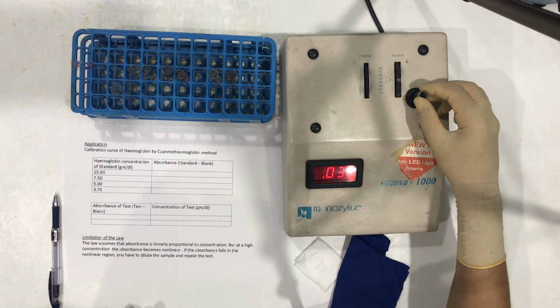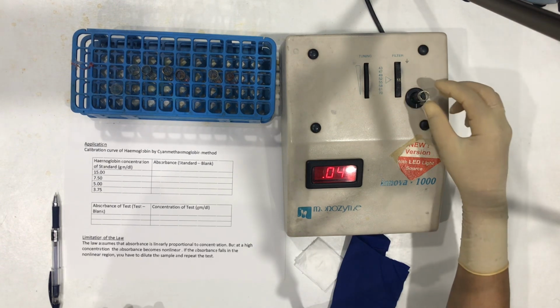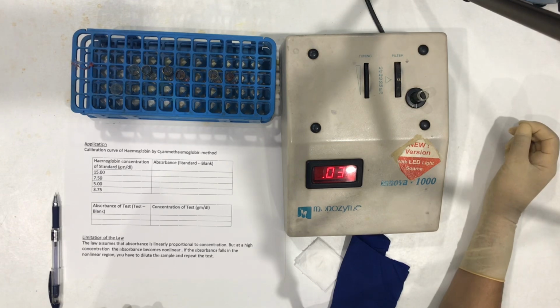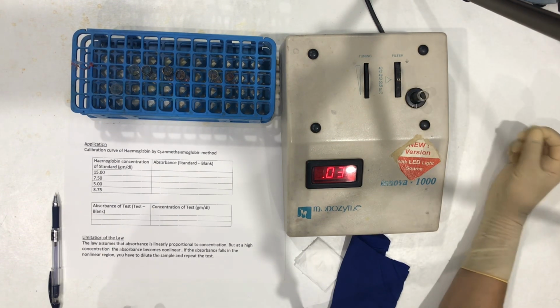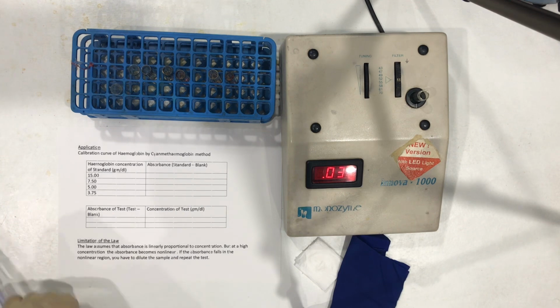Okay, the blank is giving 0.03 absorbance.